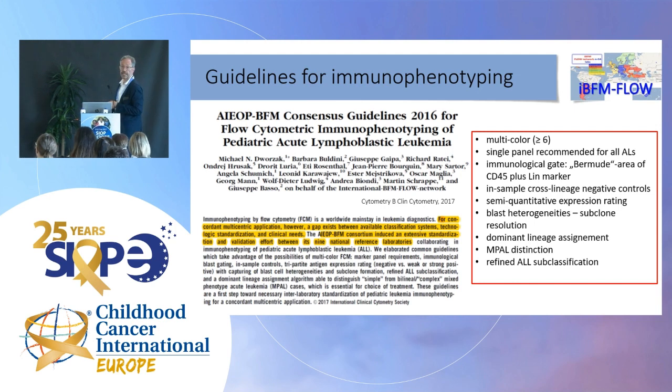Blast cell heterogeneities, the thinking nowadays on what to do when there is an MPAL, the mixed phenotype leukemias, how to think and how to work with those, because this is something which makes the so-called easygoing thing at diagnosis more tricky.